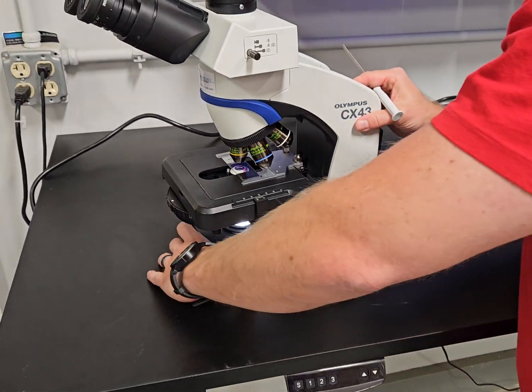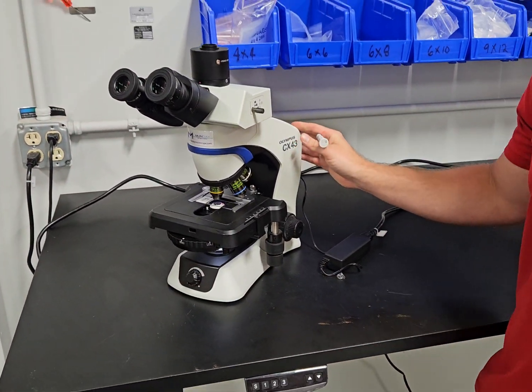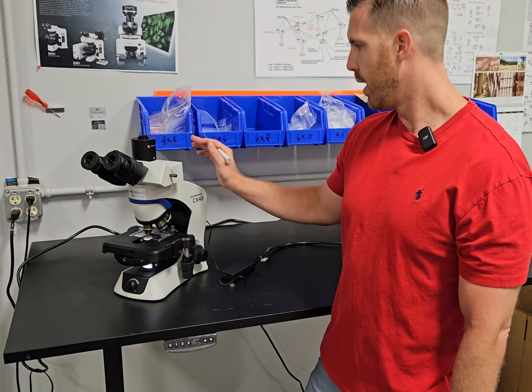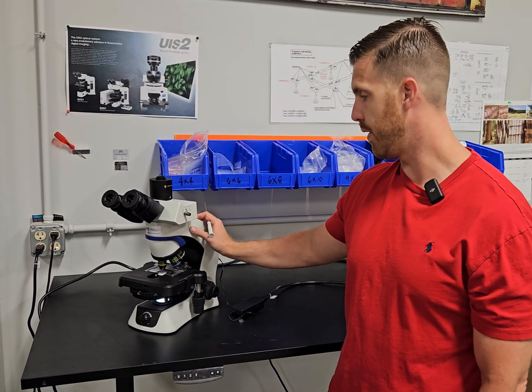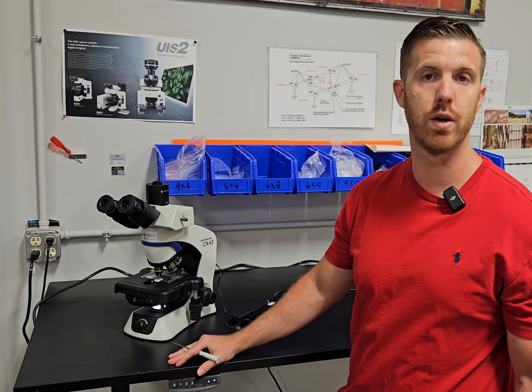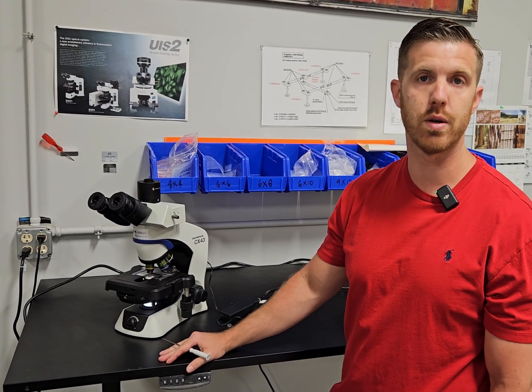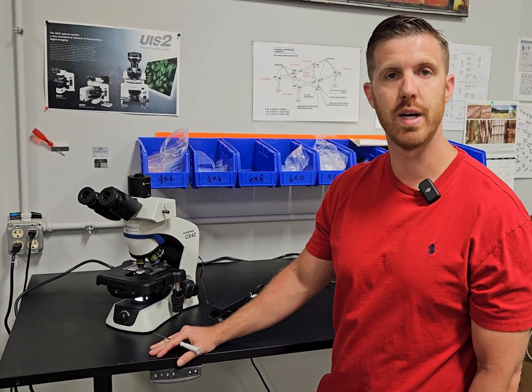That's basically it on this scope. This is a great little durable microscope. Customers seem to really like it, and if you have any questions about this scope or any other microscope, especially for clinical use, you can call us at 919-775-5596.